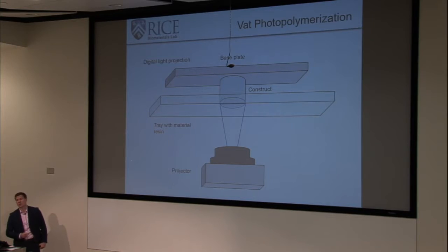There's also, in a lot of synthetic polymers, what's called a burn-in layer, where you overexpose the first few layers of your material, which increases the adherence to this base plate. And I don't know, there's a couple students from Jordan Miller's lab here, right? I don't know if you have an answer to that too, because I know you guys use PEG in a DLP process or a stereolithography process. Are you familiar with your strategy for encouraging that material to stick to the base plate? I don't know if you work with it or not.